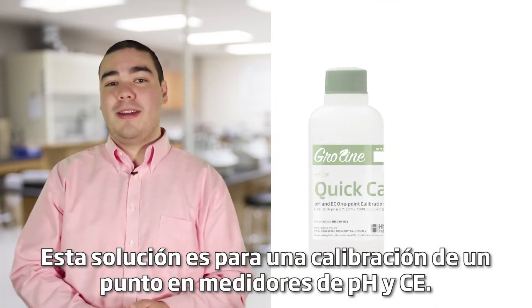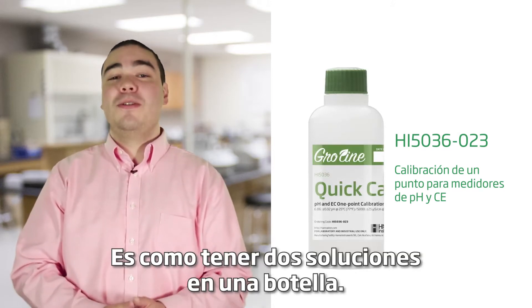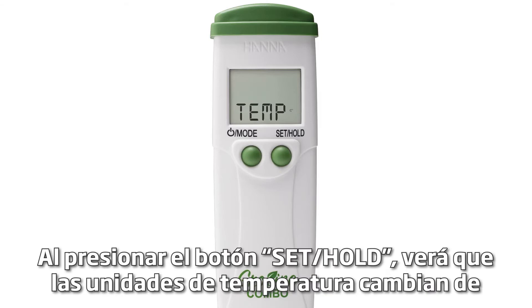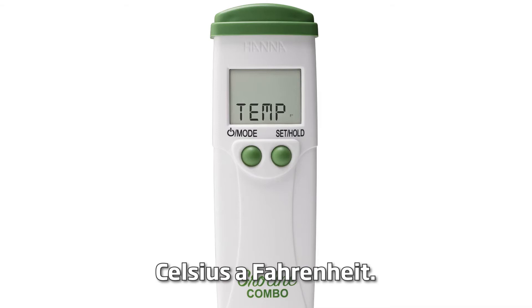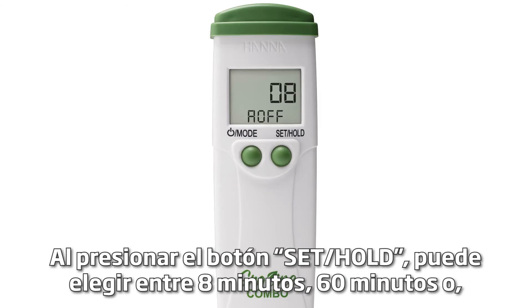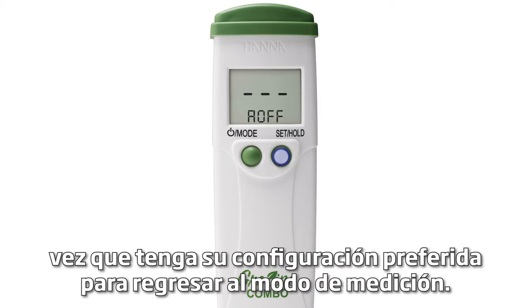Cal quick allows you to use our GroLine quick calibration solution. This solution is for a one-point calibration in both pH and EC meters — it's like having two solutions in one bottle. Once you have your calibration type, press the mode button again to choose your temperature settings. By pressing the set hold button you will see the temperature units change from Celsius to Fahrenheit. Press mode again and you can now choose your auto off setting. Pressing the set hold button will let you choose between 8 minutes, 60 minutes, or you can turn the setting off completely. Press the mode button once you have your preferred setting to return to measurement mode.